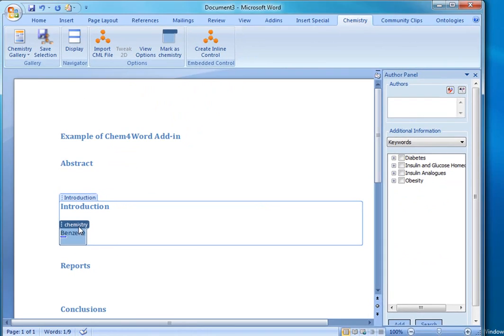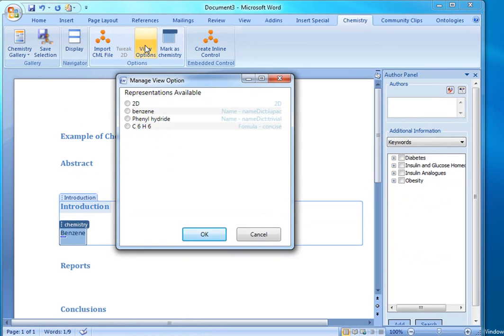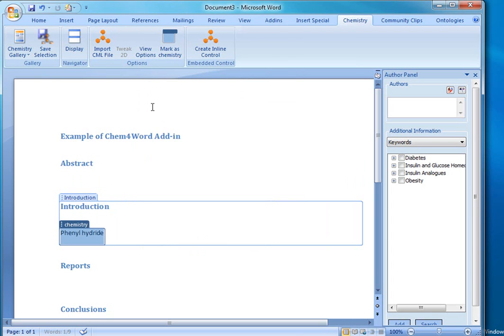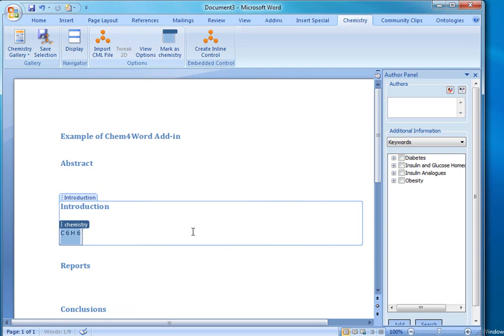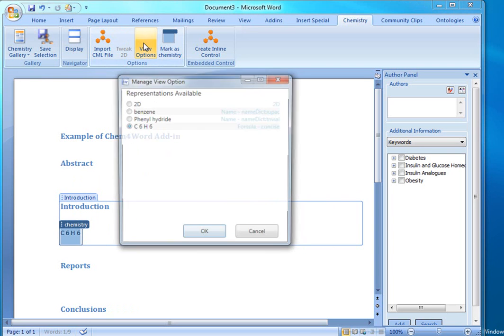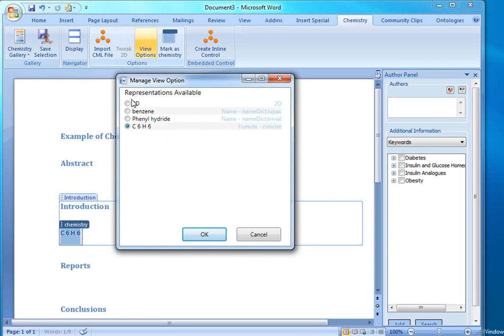So now that we have benzene recognized as a chemistry zone, we can go ahead and change the view options. So instead of using the common name benzene, we can actually use the chemical name for the compound. Or we can show the formula representation for it, or change this to the 2D representation.